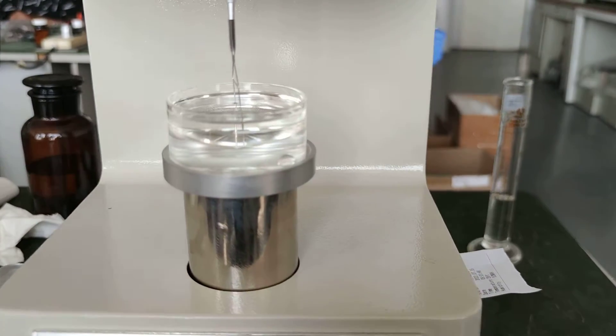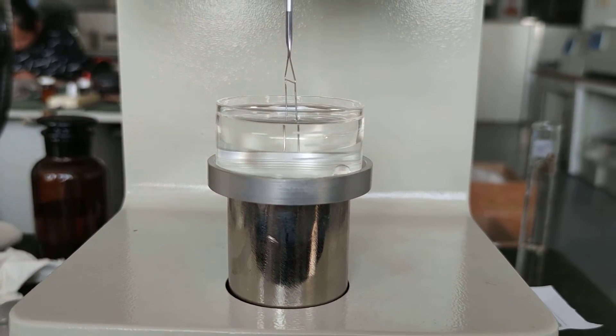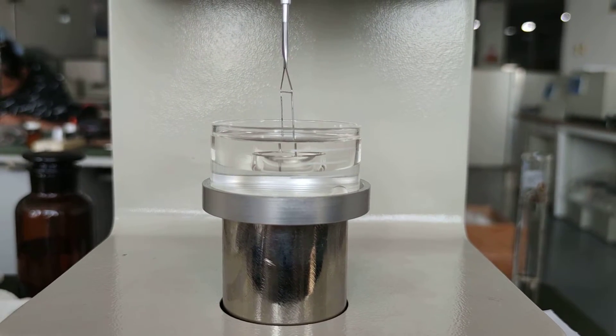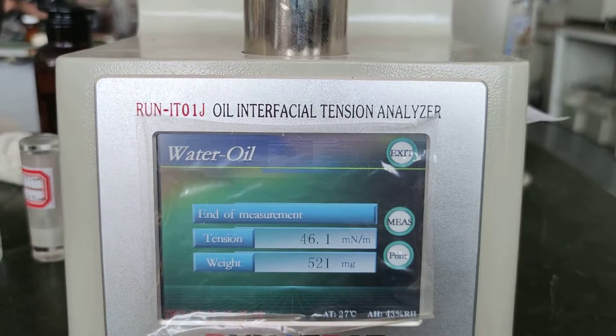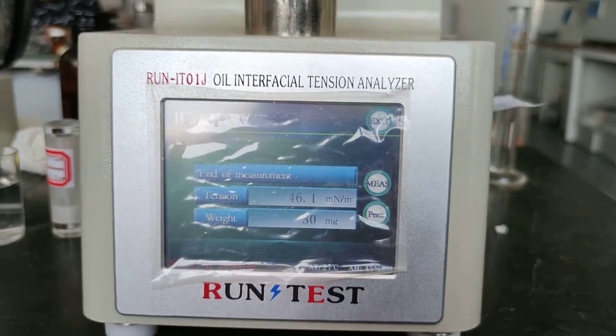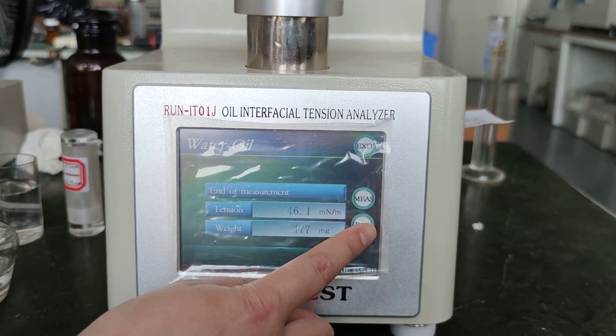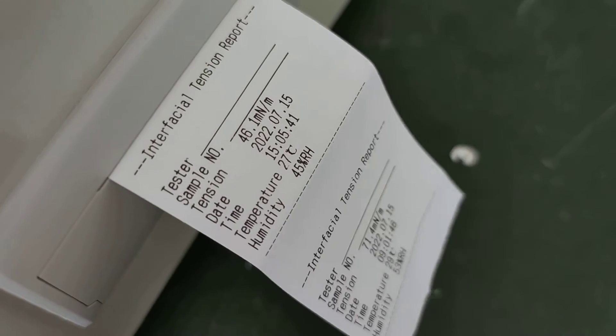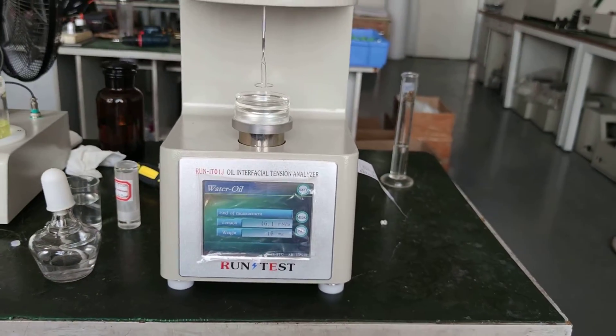Now you can see the oil cap is falling. Here comes the result: 46.1. We can print the test result here. That is the procedure for how to use our oil interfacial tension analyzer.